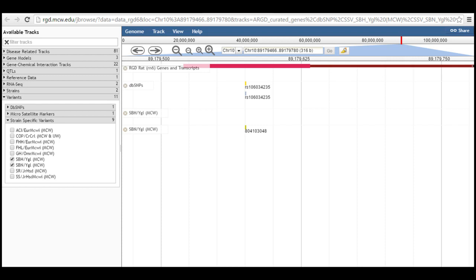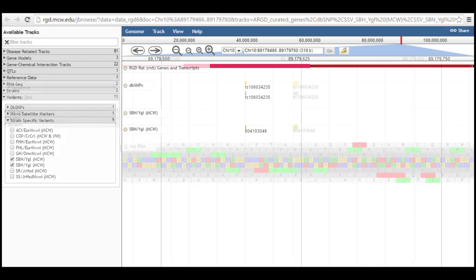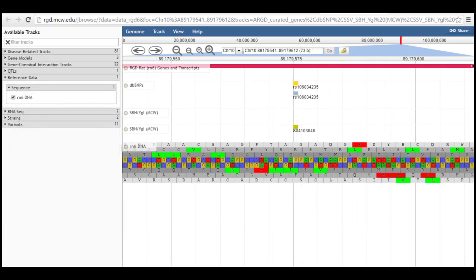Zooming into the area immediately surrounding the variant, you can turn on the RN6 DNA track and see the G reference nucleotide and Q amino acid at this location.